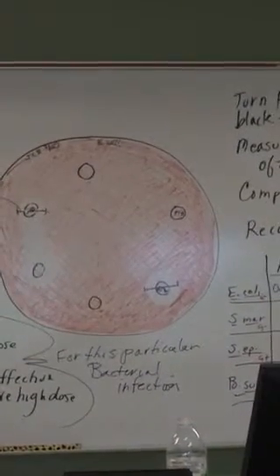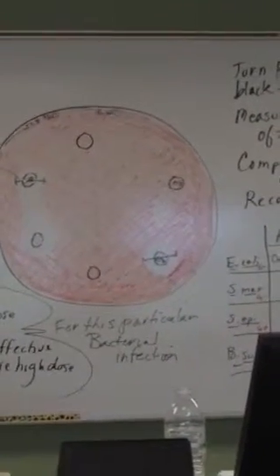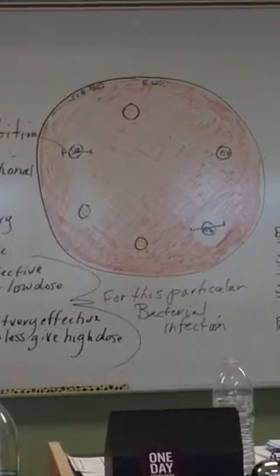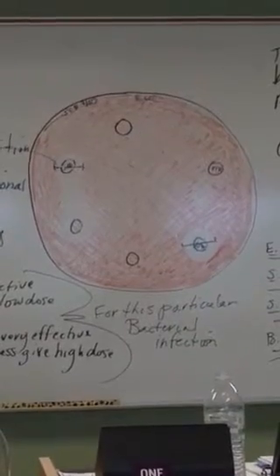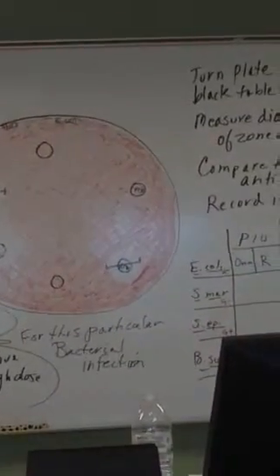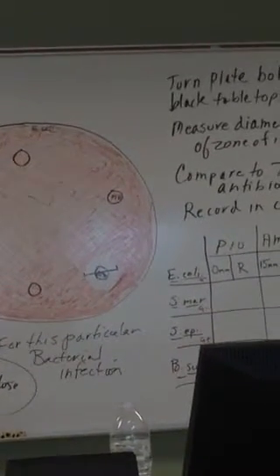We also talked about the Kirby-Bauer method. It tells you something about the antibiotics for that particular infection. E. coli, ampicillin might work, penicillin's definitely not going to work. But that's not where it ends. We also have to do other tests, like a minimum inhibitory concentration test.